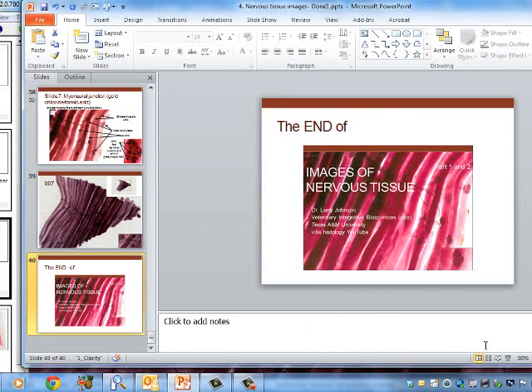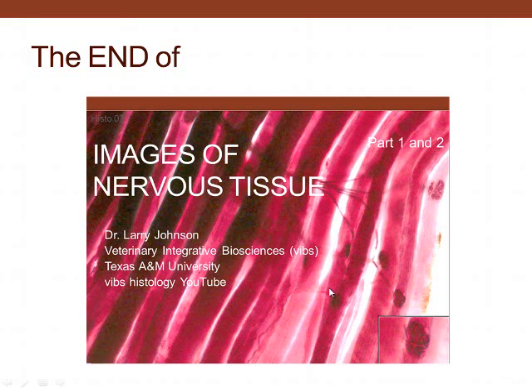And so with that, we conclude the images of the nervous tissue, part 1 and 2.